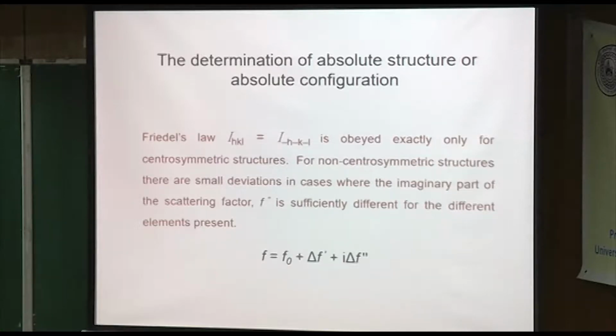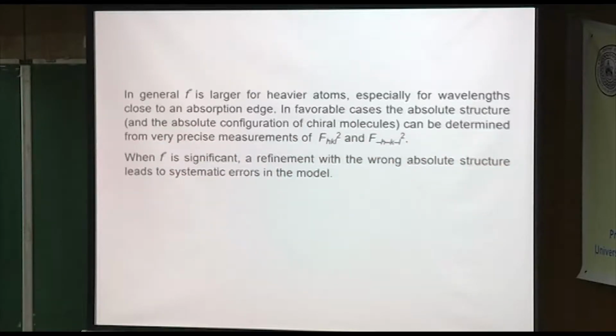It's not as dramatic for non-centrosymmetric structures unless there's a heavy atom, usually. With heavy atoms, it can be pretty different. And this, again, especially if you're near an absorption edge. Okay, that's all stated right there.